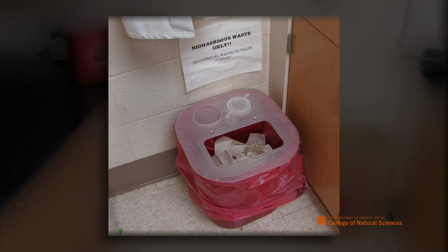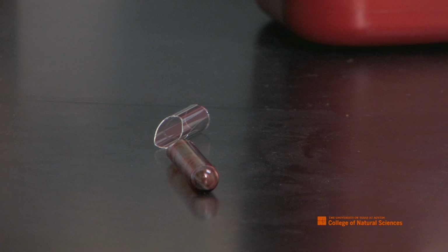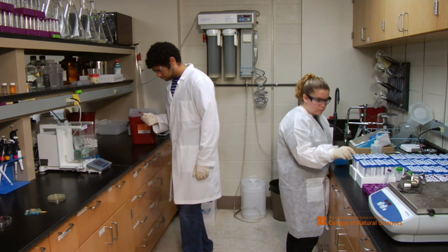Satellites, or small biohazard waste collection points, may be present at locations of use throughout the lab, for example, near instruments or lab benches. If broken glass or sharps become contaminated with a biohazardous agent, they should be disposed of in a sharps container.